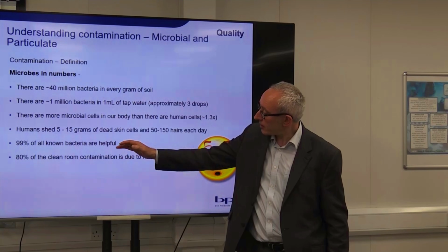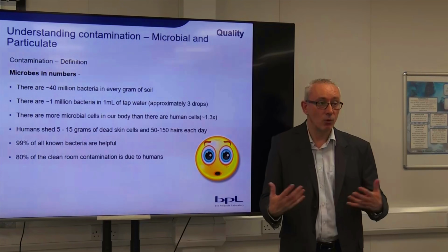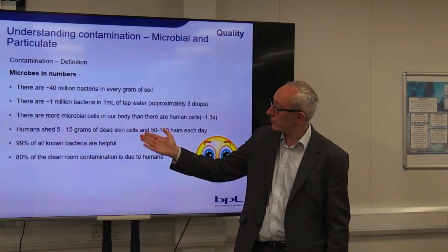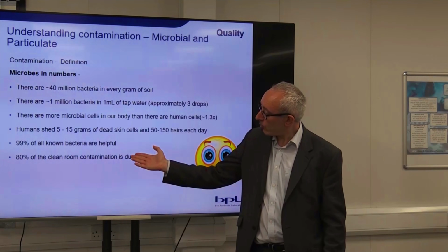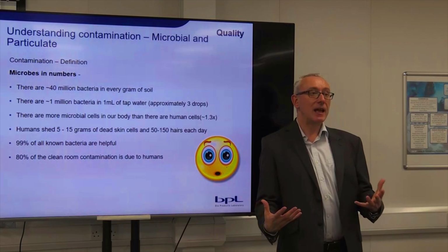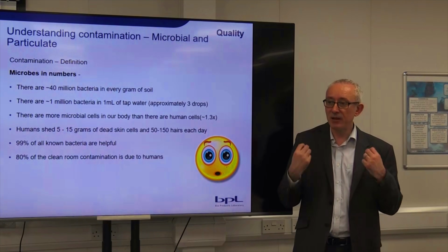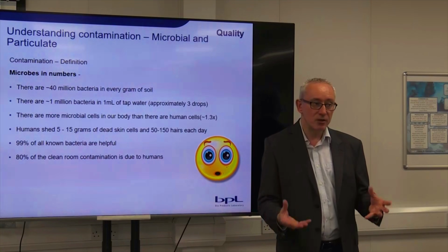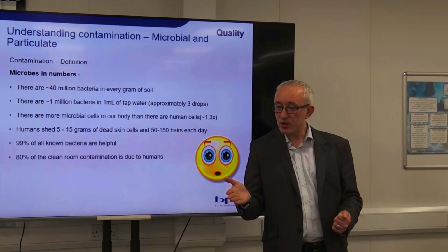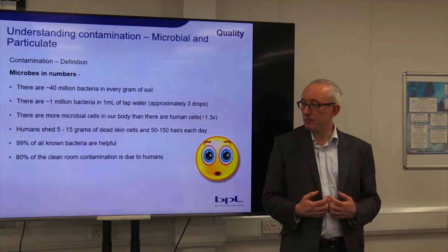And although a lot of bacteria are not harmful, the majority do some good or are just not harmful at all, there are a number which are, and even that 1% could prove challenging. And one thing we'll come back to a few times is that when we look at clean room design, it's very easy to build a clean room that works really well. The problem is when you put people inside the clean room. There's lots of research that's been done to say that most of the contamination in the clean room and most of the risk to the product comes from ourselves. So we are the biggest contributors of contamination.